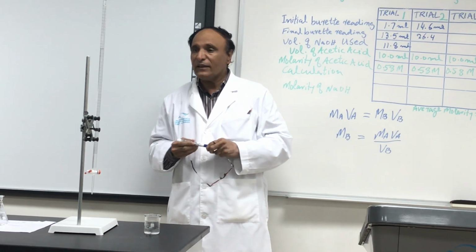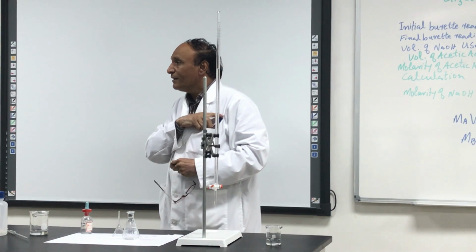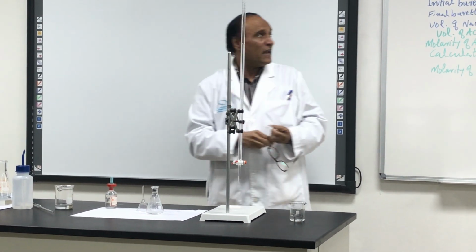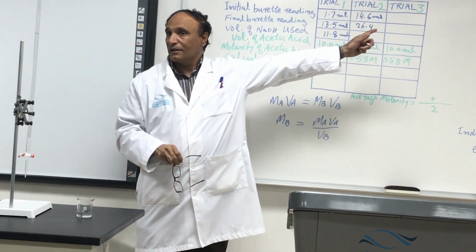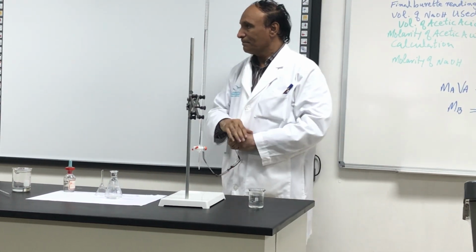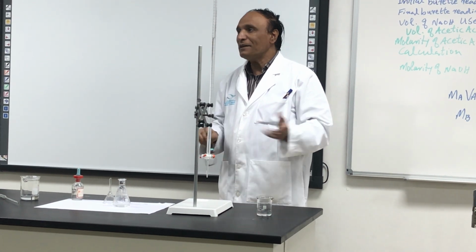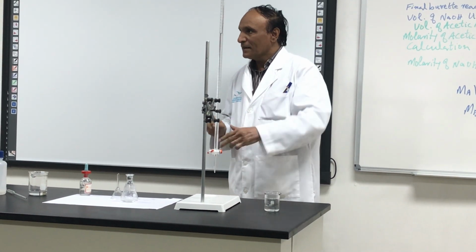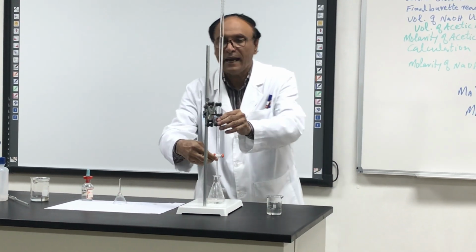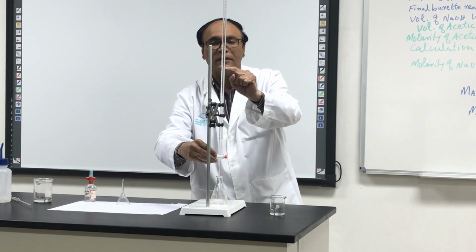26.4. So when I go to 26.4, there should be the end point. This time what will I do? I have to go to 26.4. So I will add up to 25 directly. Not step by step, no need, because we have the experience of the first. So I take this one and then I add into it up to 25. Up to here I will add.